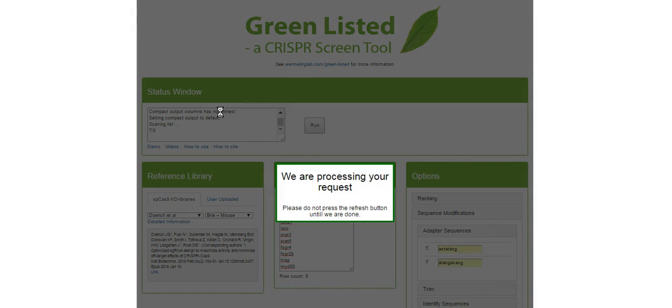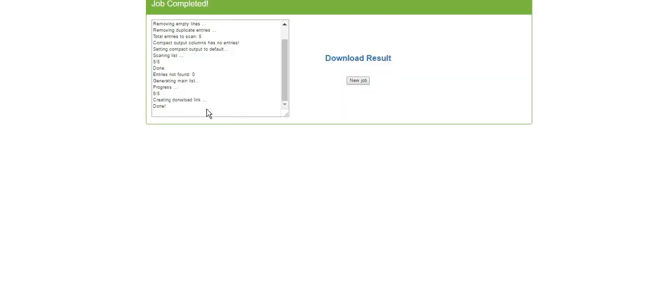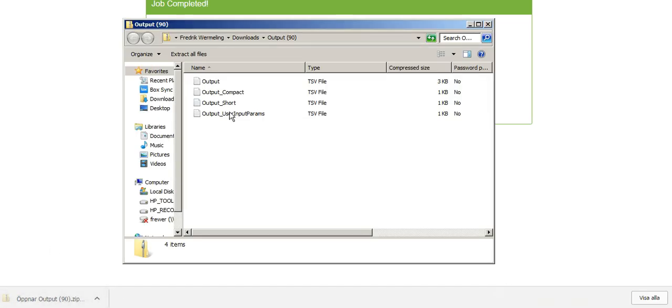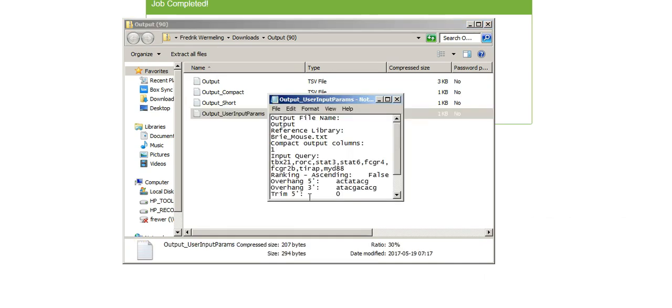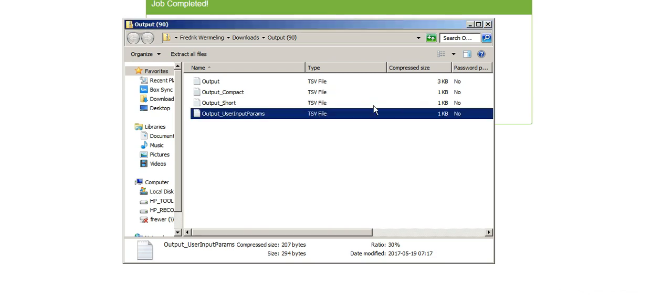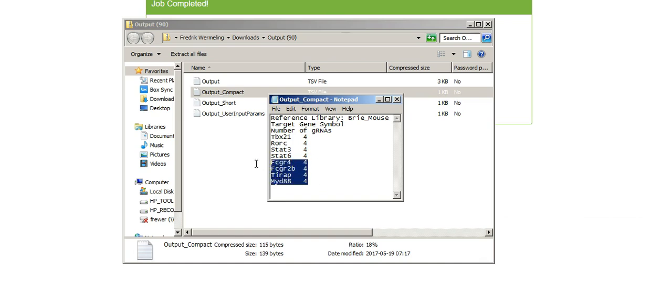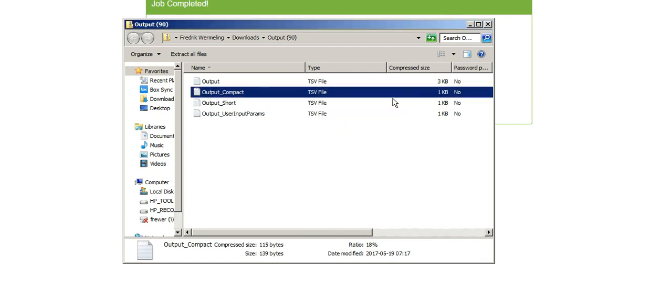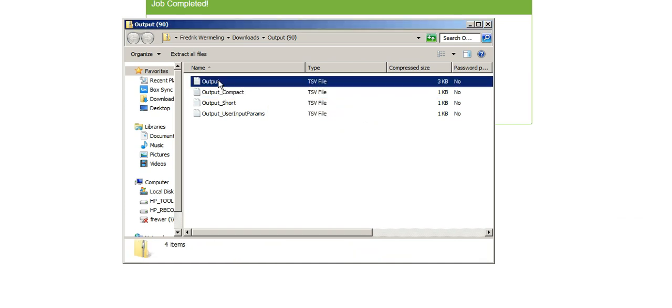And then in the left corner, oh sorry, and then it's done. And you press download result. In the left corner here, you find an output list containing a couple of different things. User input parameters is just a reference for you on what did you ask the software to do, which could be good for in the future. Output compact here is just telling you which genes you asked for, and how many guide RNAs you found, which could be a good way of just quickly looking into it and evaluating, did everything go as you wanted. And then there's two files here.